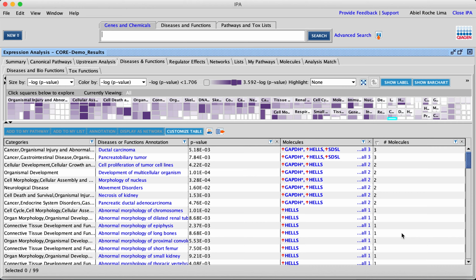They don't know that your scientific question is answered based on the list of proteins you have. You're answering that question based on the annotations they provide, so you can get a better understanding of the association between the statistical significance and the information that IPA provides for you.